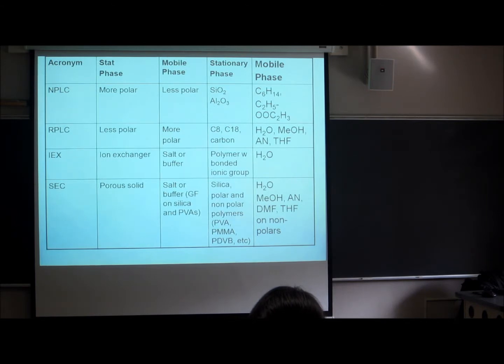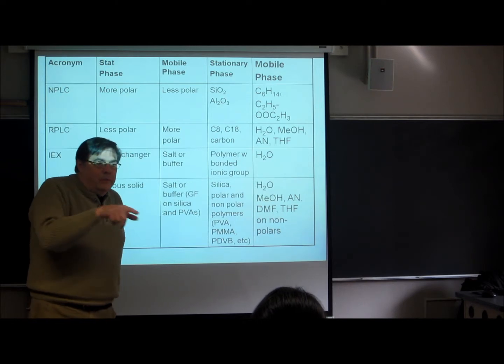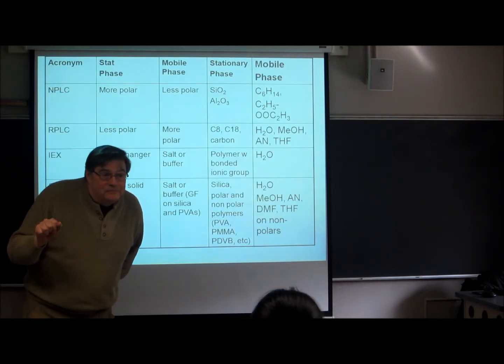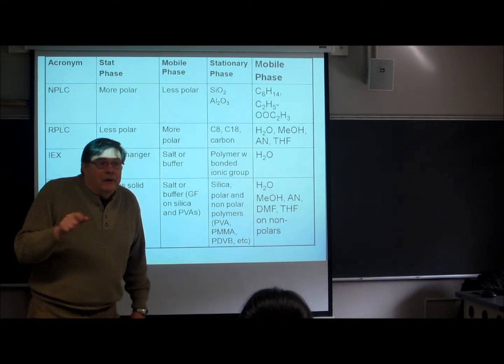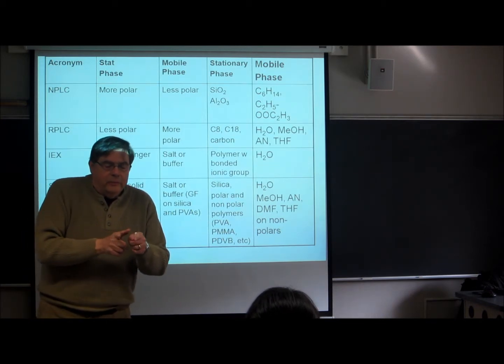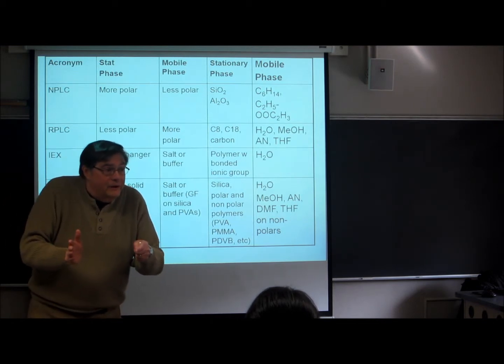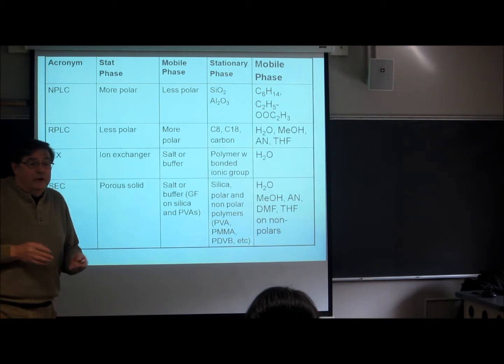If you go around and look at gas chromatographs around the university here, I'll bet 99.5% of them are connected to helium gas. Fine gas, wonderful. A little bit pricey now, but the mobile phase is always helium. So how do you change the separating power of the GC experiment? Temperature. Yeah, program temperature, right. You can take some close peaks at the beginning and run them cooler and then ramp up to get the later ones to move down, to save yourself time. So temperature is your variable there.